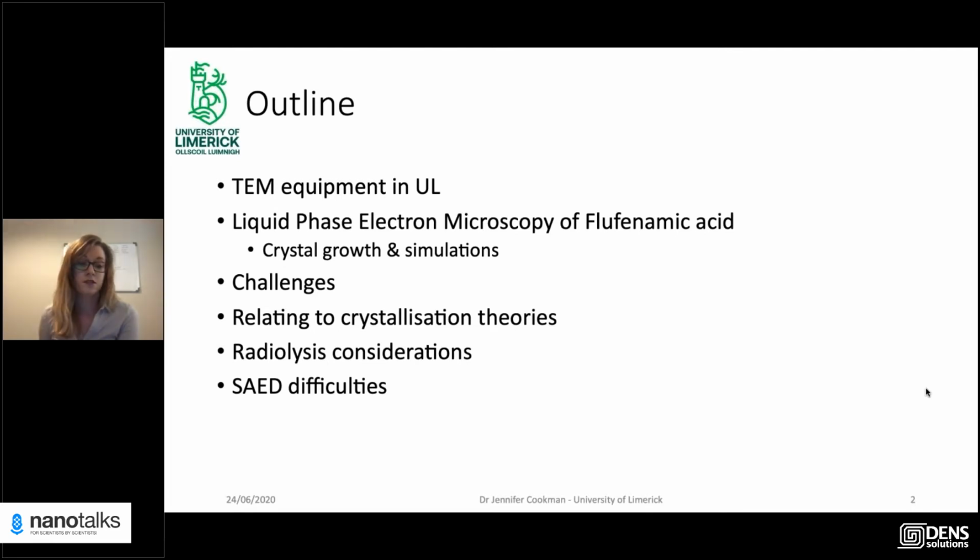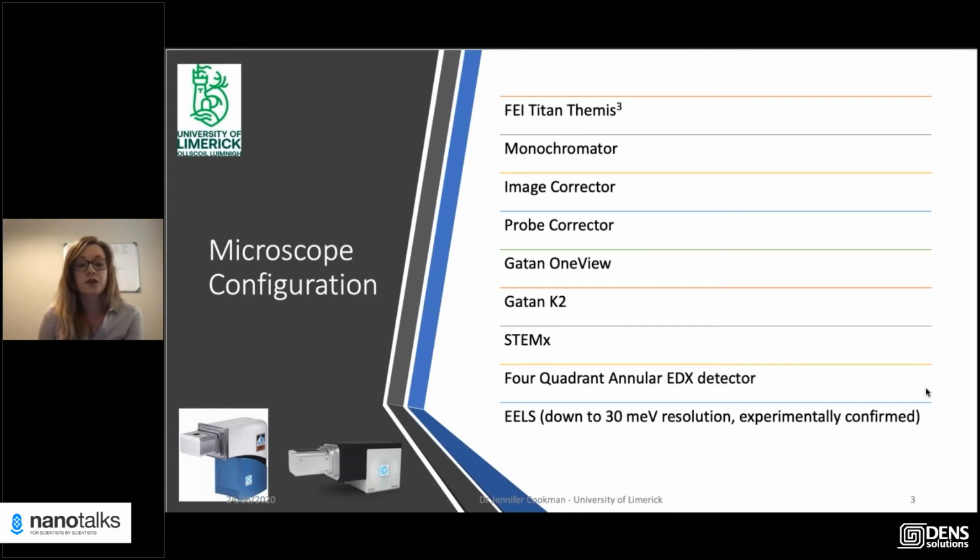Also some considerations of radiolysis, which is one of the most important things that we have to look at when dealing with liquid phase electron microscopy experiments, and then also the difficulties of acquiring selected area electron diffraction patterns with the ocean holder. So first of all, in University of Limerick, we have a really nice FEI Titan Themis cubed.